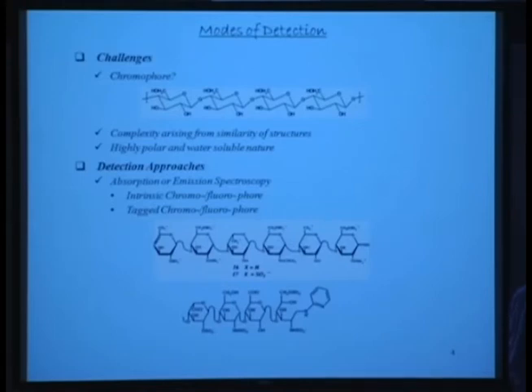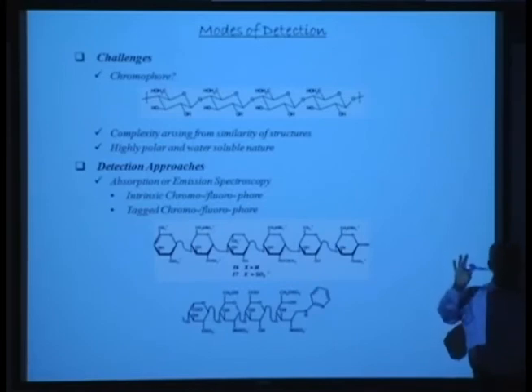More hydrophilic. Yeah, this is more hydrophobic. Sure, absolutely. This can be used in a hydrophobic column. Actually, if you leave these molecules, they tend to aggregate, and you would see that they tend to precipitate. So you have to be careful with regard to your glycans. Your glycans are very polar, and at the end you have non-polar. So this is a good combination: if this is polar, this is non-polar.